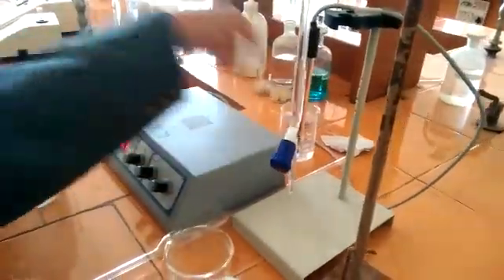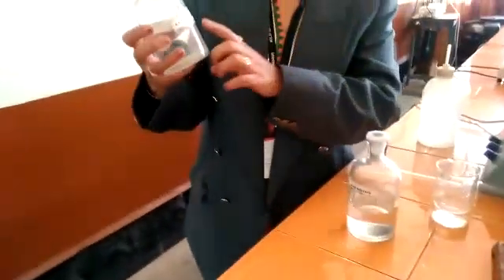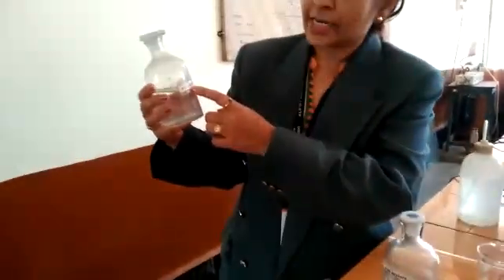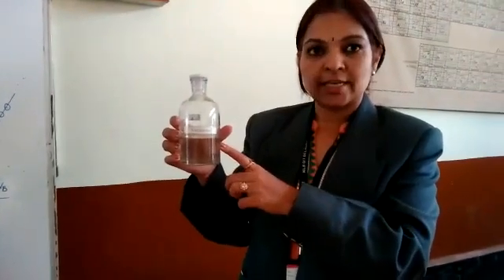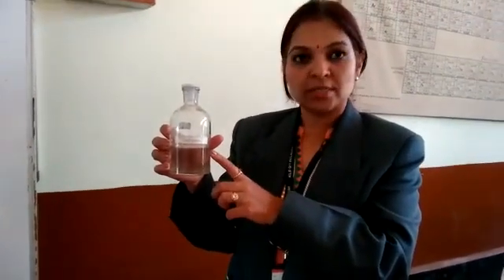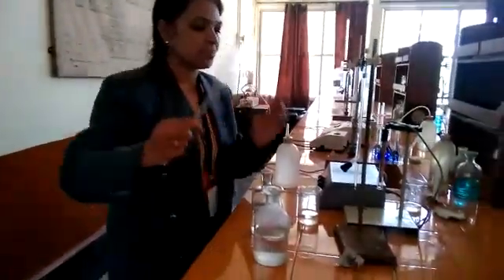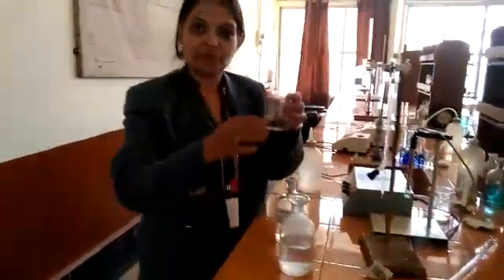These are the two solutions supplied to you. One is the standard solution of NaOH at a concentration of 0.5 N, which should be filled in the microburette. The acid mixture supplied to you contains HCl and acetic acid solution. 50 ml of the acid mixture should be pipetted out using a pipette into a beaker.